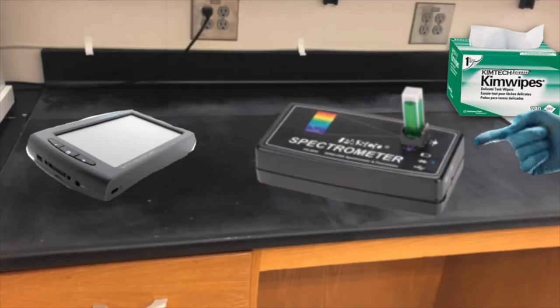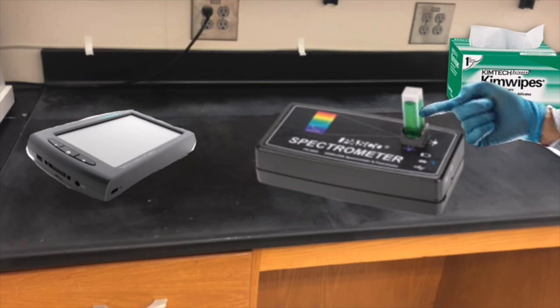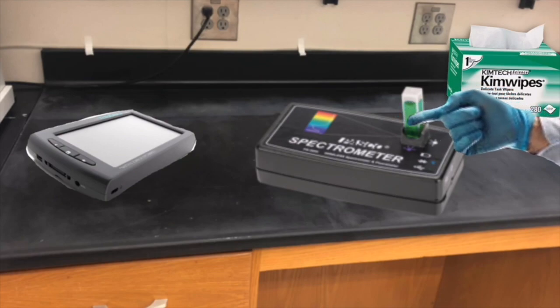Here we are. This machine is a spectrometer. It separates wavelengths of light and detects how much each wavelength is absorbed. To take an absorption spectrum of the solution, we would first pipette it into this small rectangular prism called a cuvette. Its standard width is 1 centimeter.